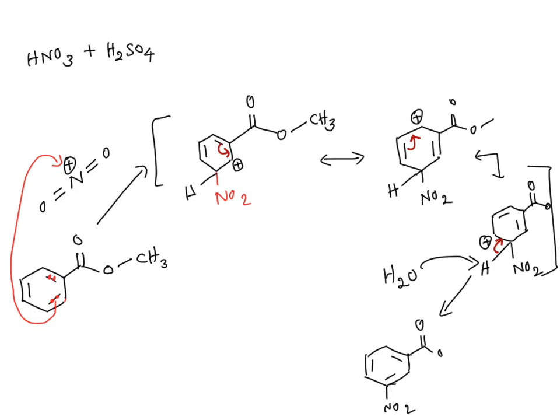The other questions that we need to answer from the back of the lab manual is, so this is the arrow pushing mechanism, that is question number 1 on the post lab. Draw the arrow pushing mechanism. It is one arrow that goes from the pi bond to the NO2, and then the arrows for the resonance, and finally the arrow for deprotonation, right?